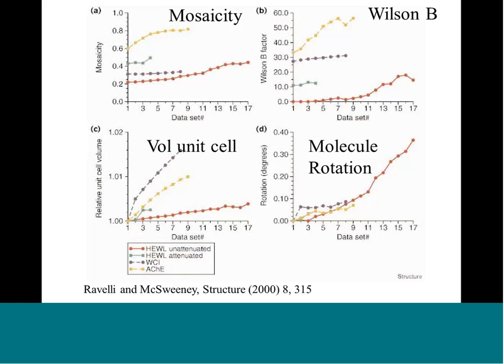A fourth alarming thing is that the molecule can actually rotate within the unit cell, within the minimum translatable unit. This means we get non-isomorphism within one dataset, because the unit cell is increasing and the molecule is rotating within the unit cell. Francis Crick and Beatriz Magdoff showed in 1956 that if a unit cell of 100×100×100 increased by 0.5 angstroms on each dimension, then the intensity of the reflection at 3 angstroms would change by 15% — a terrifying number.